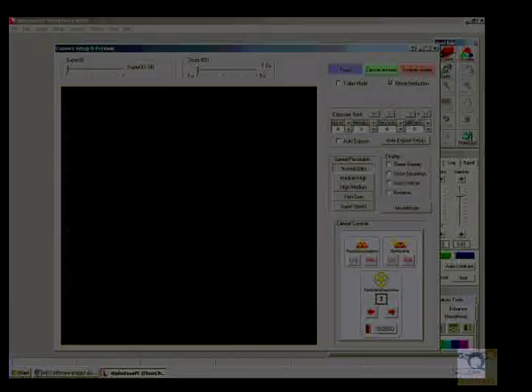It is recommended you take several images of the plate at different exposure times as each camera, assay, and setup is different. Other suggested image times are 1 minute, 2 minutes, and 4 minutes.